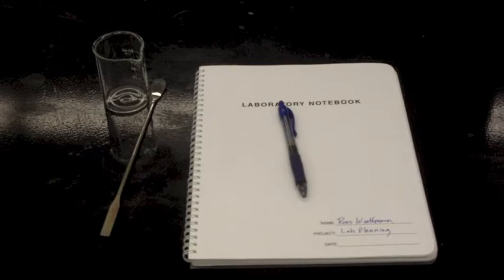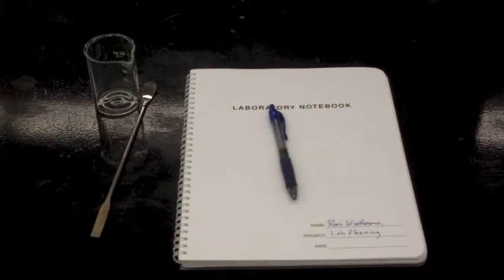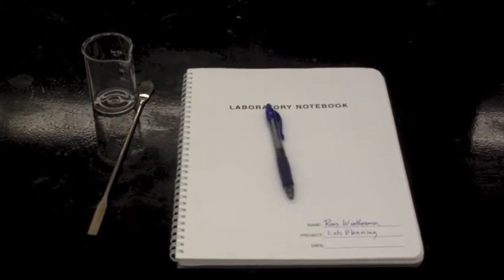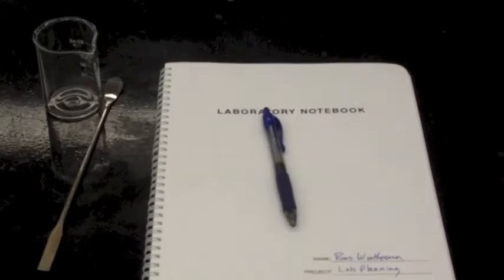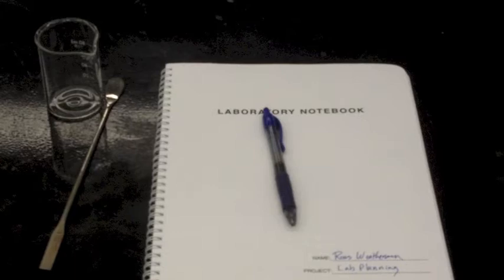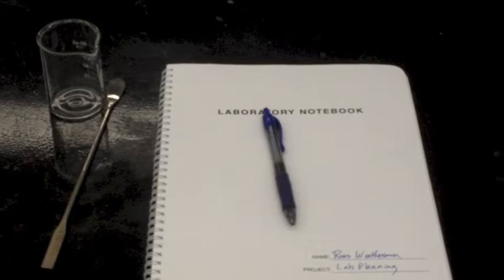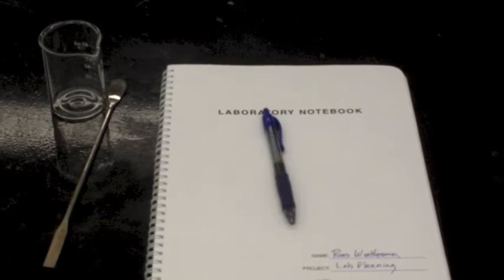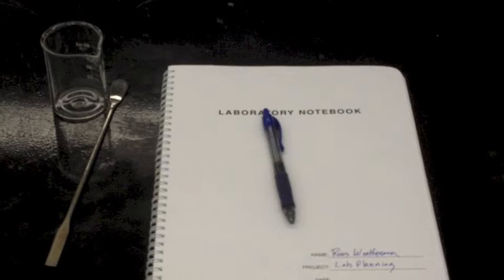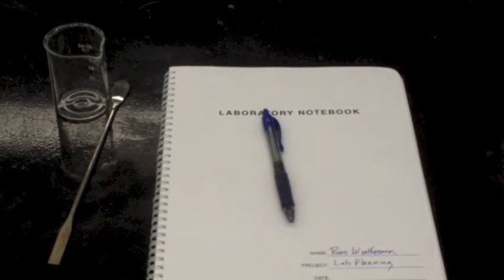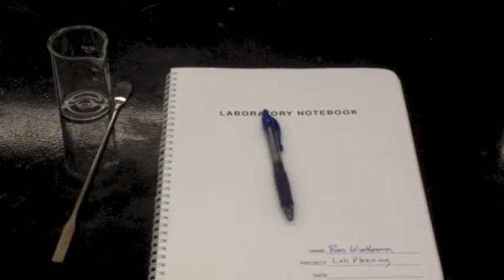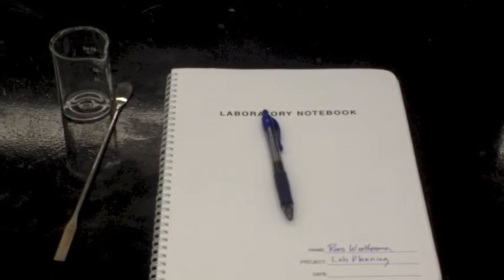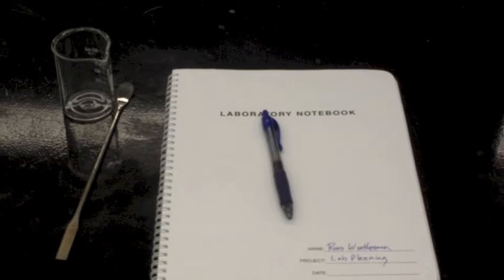We have a lot of labs where we use the balance, and the key is to be efficient. The most important thing with efficiency is knowing what you need to bring up to your balance each time. You should have a lab manual, your spatula you're going to use to weigh, and something to weigh into—preferably something dry, because having something wet can either get water on the balance or distort your values if you have evaporation.